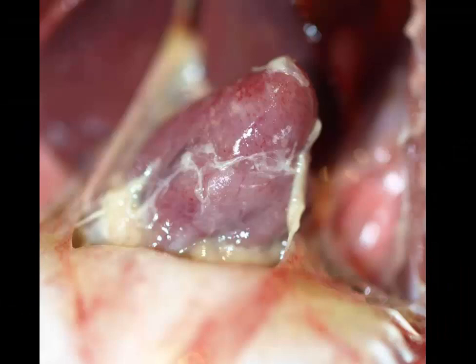Slide number 7 is from a duck. Can you give me a morphologic diagnosis and a cause? Okay, time's up. We're looking at the heart. It would appear that the pericardium has been removed, so we're looking at the epicardial surface and a fair amount of fibrin on the surface of the epicardium, potentially within the pericardial space.